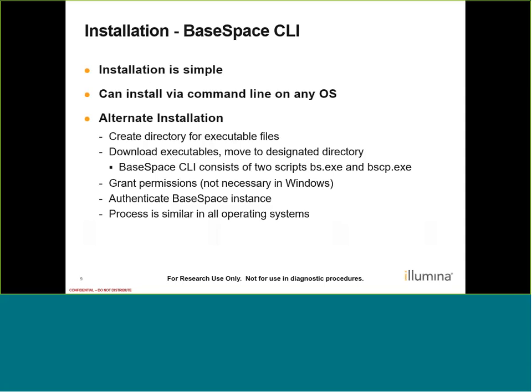Once we have our scripts in our designated directories and the permissions have been properly added, we can then authenticate our BaseSpace instances so that we can perform work using CLI. And lastly, the process is similar in all operating systems. CLI does not require root or admin access, but you will need read and write access to the directory that you're going to use to put your CLI files in.